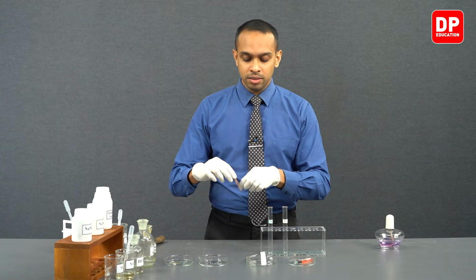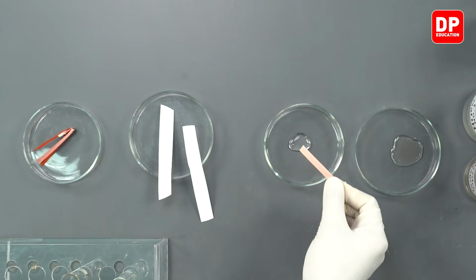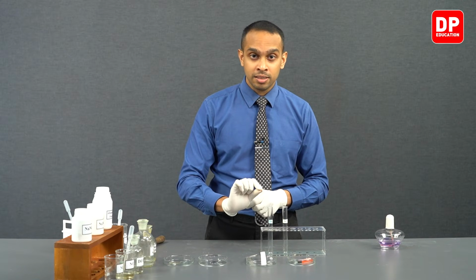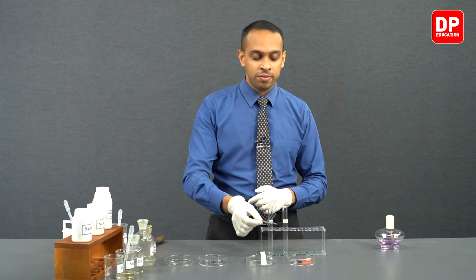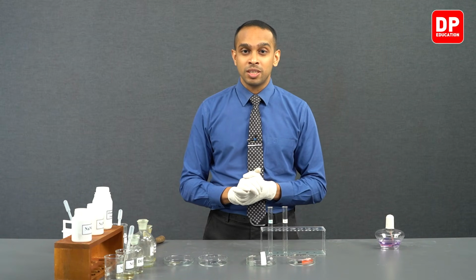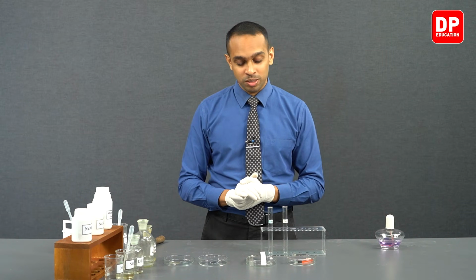We'll take this red litmus paper, quickly soak it in a little bit of water, and then hold it against the ammonia gas. So you can observe the red litmus paper turning blue in the presence of this ammonia gas that is produced.